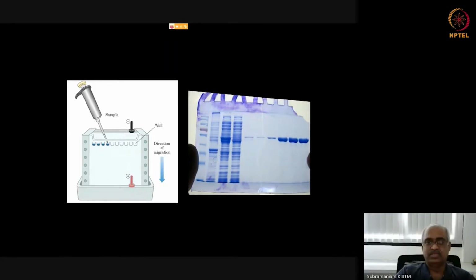So what we do is, after melting, we pour it onto an acrylic sheet based tray, and in the tray it solidifies and you make the gel. So the shape of the gel depends on the shape of the tray. Usually it's a rectangular boat-like structure with the shorter dimension open.